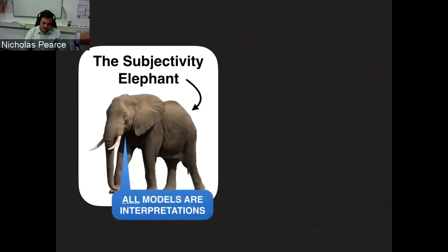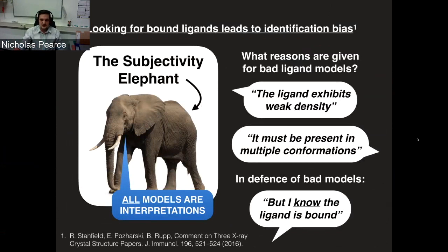The elephant in the room is that we are all humans interpreting this data, looking for bound ligands. We run the risk of confirmation bias — seeing a blob that looks like our ligand and modeling it because we want the ligand to be bound. We end up making excuses such as 'my ligand exhibits weak density,' 'it must be in multiple conformations,' or most dangerously, 'I know the ligand is bound, so therefore it's bound in the crystal,' which isn't always true.